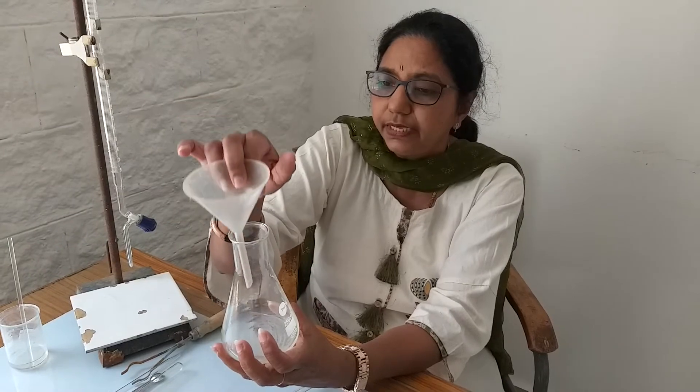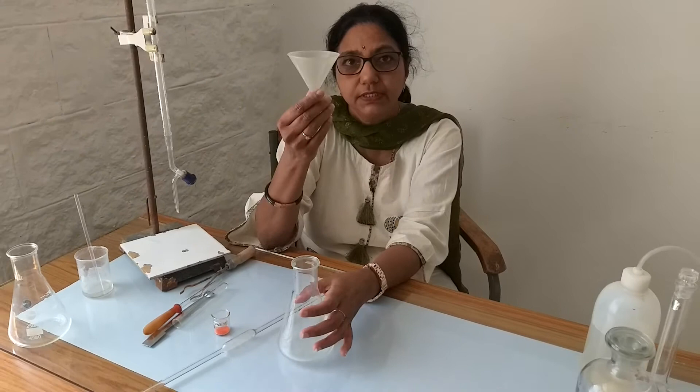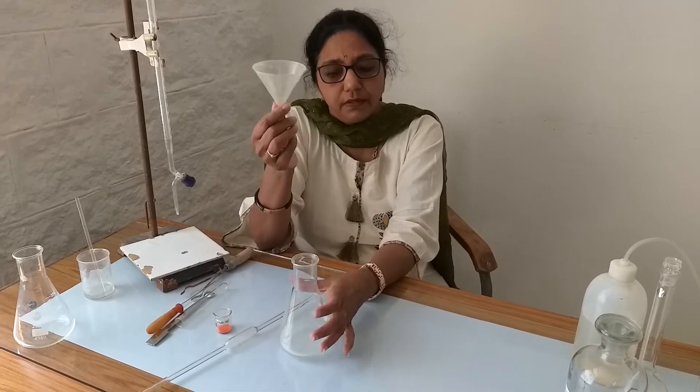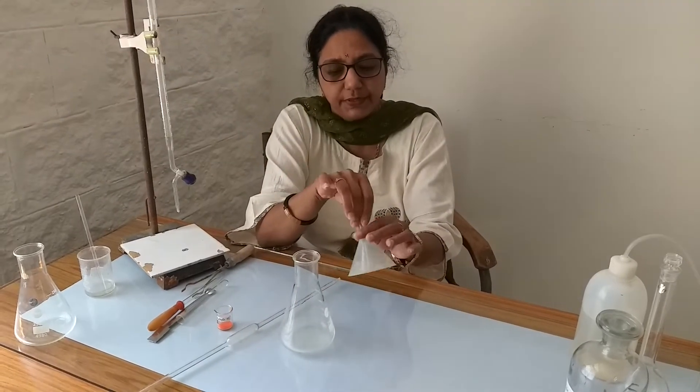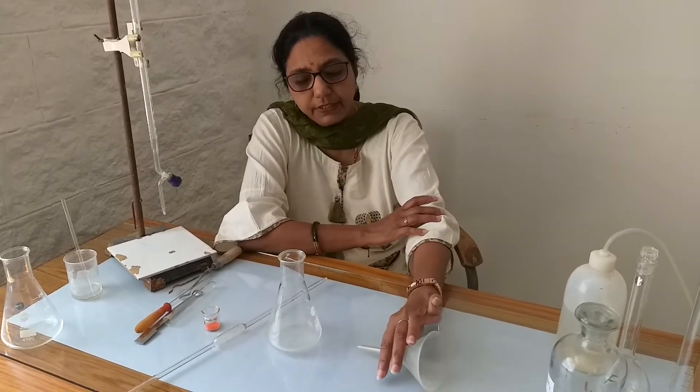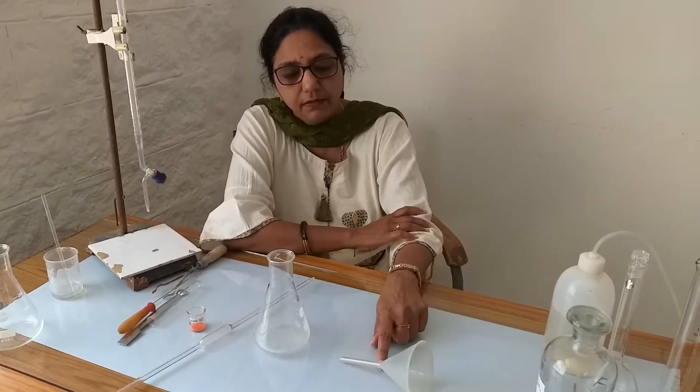We take the solution with the help of funnels. This is a plastic funnel; we can also use a glass funnel. When we put the funnel, it should be kept like this — this is the right way of putting the funnel. If we put it incorrectly, it may roll down and if it falls, it may break into pieces and the students working in the lab could get hurt. So for lower classes, we usually give plastic funnels, but glass funnels can be used as well.